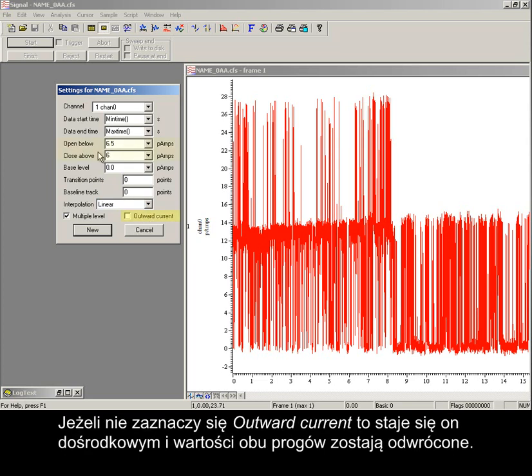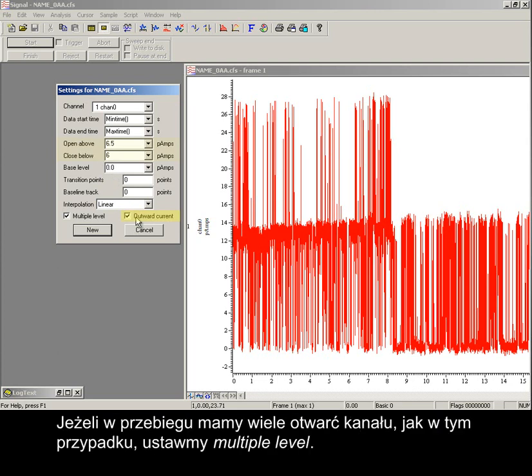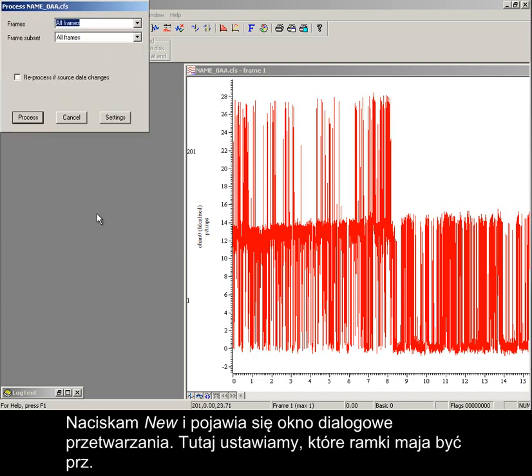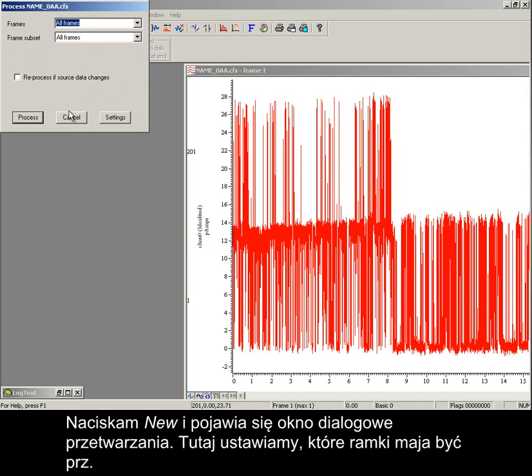If unchecked, outward current becomes inward, and the two threshold values are reversed. If we have multiple channel openings in the trace, as in this case, then select multiple level. Press New, and the process dialog appears.